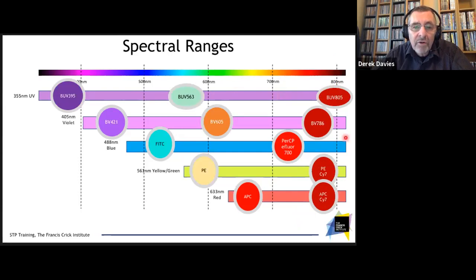So these 4 fluorochromes in particular are all emitting in the same area of the electromagnetic spectrum. So although this is optimally excited by UV, this is optimally excited by violet, and so on, there may be some excitation of this dye by the violet laser, and that would be detected in the same area of the spectrum. So that may potentially give me some problems. So I'm always looking at that as well. So similarly, sort of here, we may have that problem.